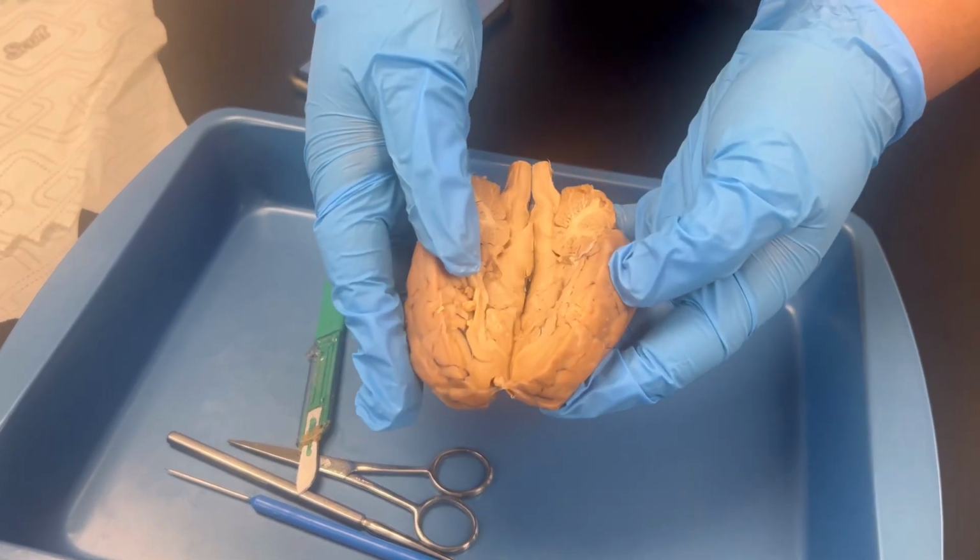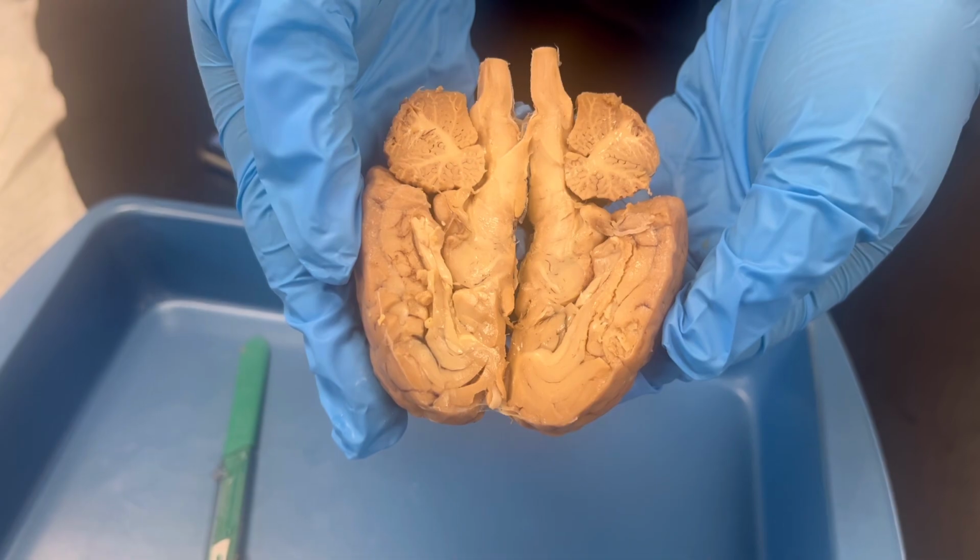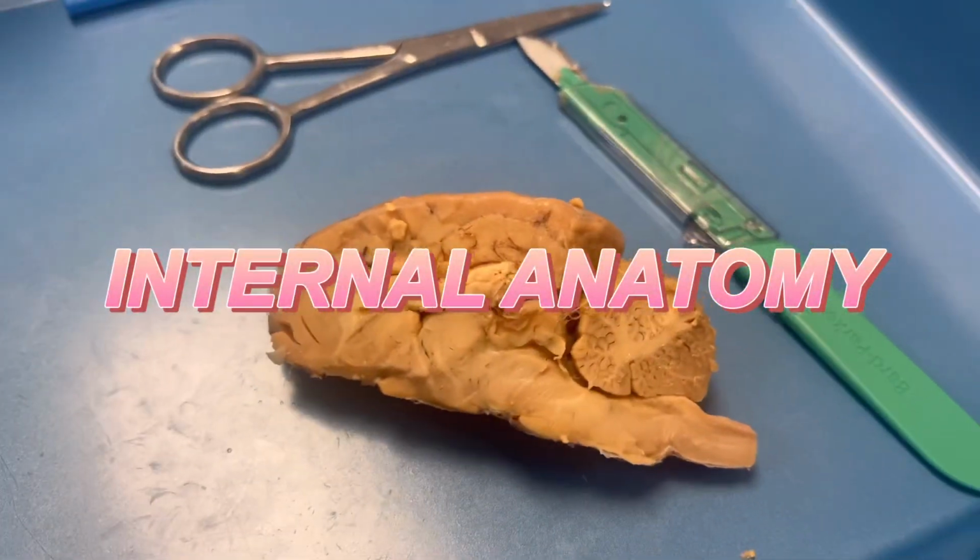And now to our second checkpoint. Here are the hemispheres in the sagittal plane, or the cross-section of the brain. The internal anatomy of a sheep's brain.